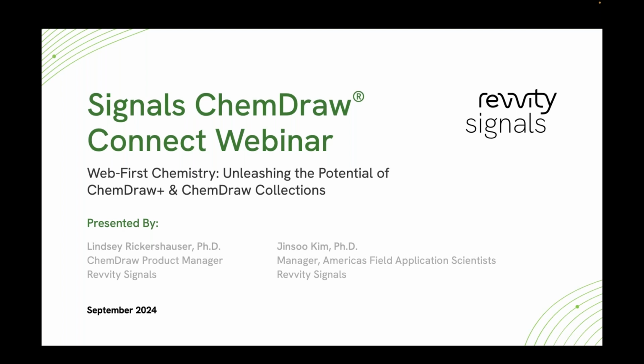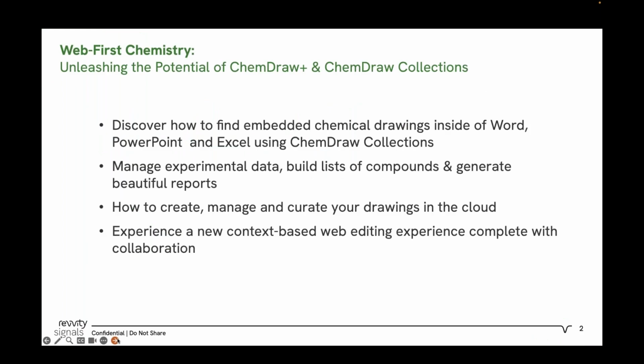Within our webinar today, we plan to cover a few topics. First of which will be our ChemDraw Collections application, in which you can find embedded chemical drawings inside of different office documents and manage your experimental data, build lists of compounds, and generate reports from them.